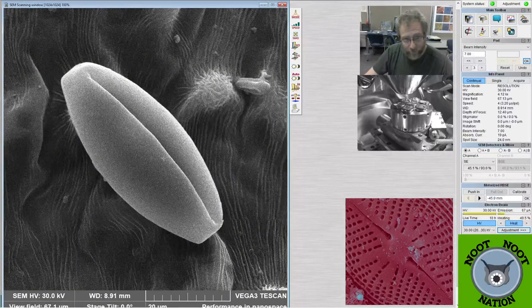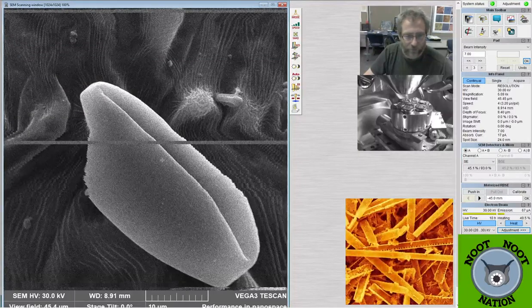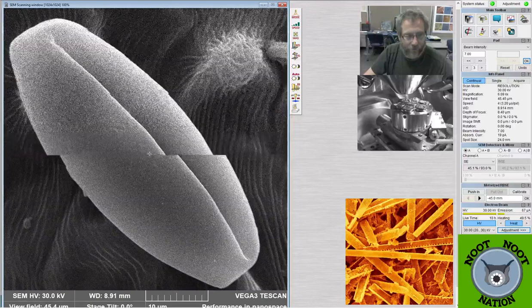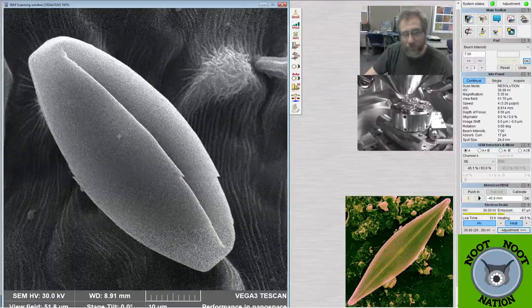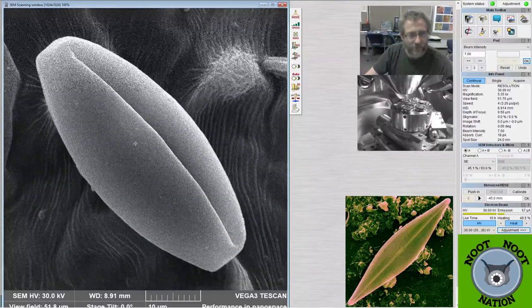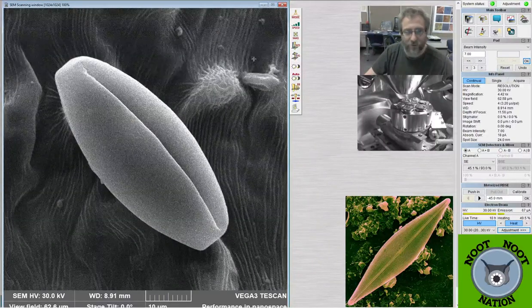If you're going to stream from it, or do something a little more aggressive with it, then you probably want a little higher-end microscope. A PrimoStar is maybe $1,000, or in that range. Anything above that, you don't need unless you're doing research. I need it, but most people don't need that sort of thing.